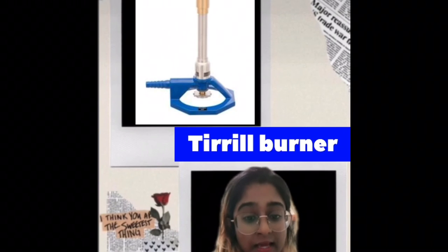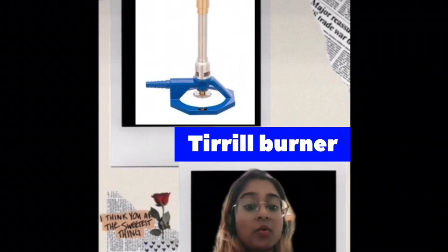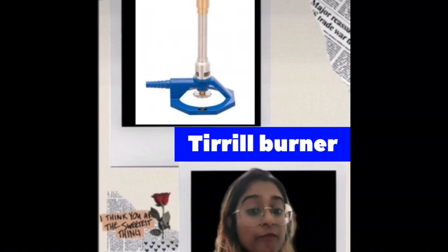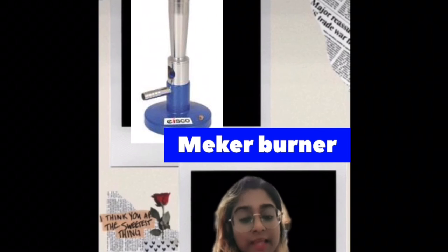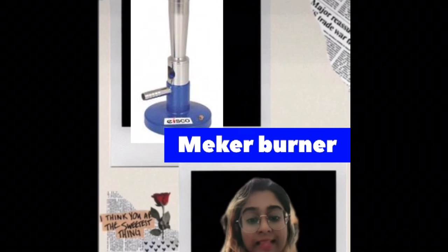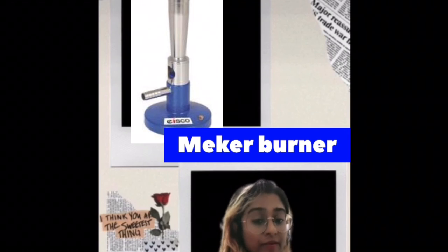The second one is known as a Tyrell burner. It is a subtype of a Bunsen burner that features a wing nut at the bottom of the tube for gas adjustment. And thirdly is known as a Meker burner, which is a radical subtype of Bunsen burner that is designed to produce extremely hot and stable flame.